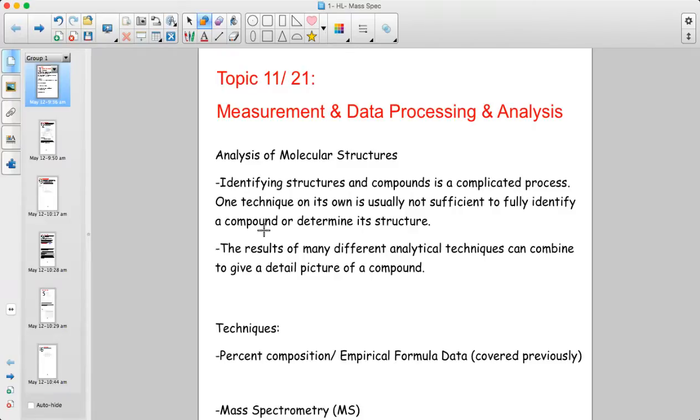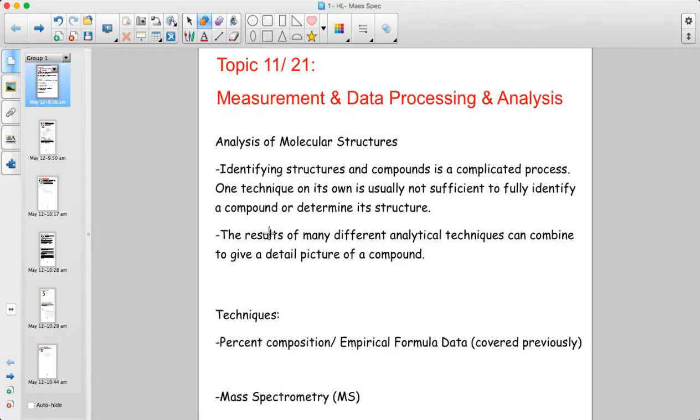structure actually is. So we always talk about how we've got ethanol or we've got pentane or something like that, and we have these chemical formulas and we can draw their structural formulas, but how do chemists actually have a chemical inside of a test tube and figure out what its molecular structure truly is, beyond just being told it on the bottle or on the label. So that's what we're going to look at here. What are the different devices and what are the different readouts, graphs, and things that we're going to get that allow us to figure out what the structure is.